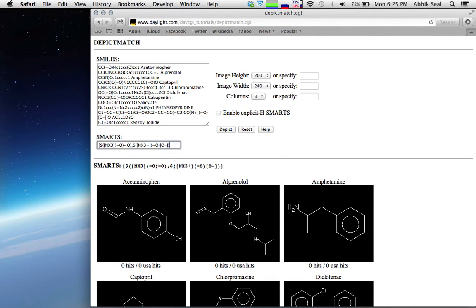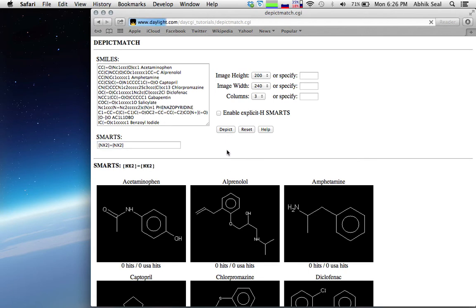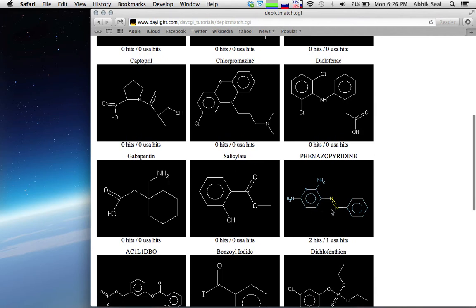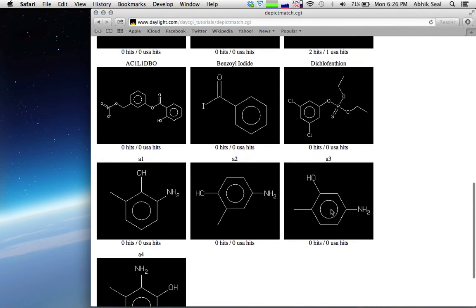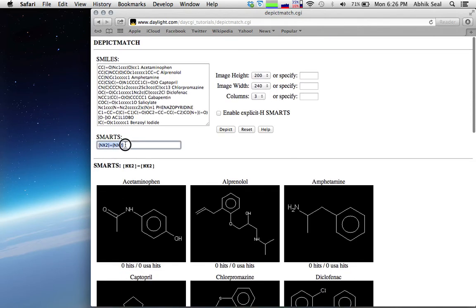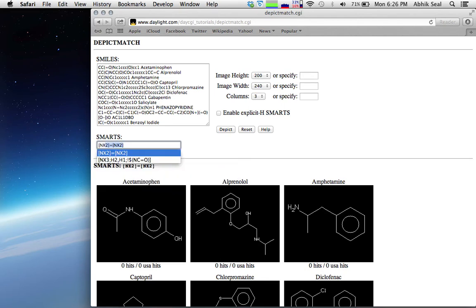Let's select azo compounds: NX2 double bond NX2. All the azo nitrogen diazines will get selected — there is one phenazopyridine and nothing else. For hydrazine it's NX3 without any bond, but it doesn't appear there are any hydrazines in the dataset.